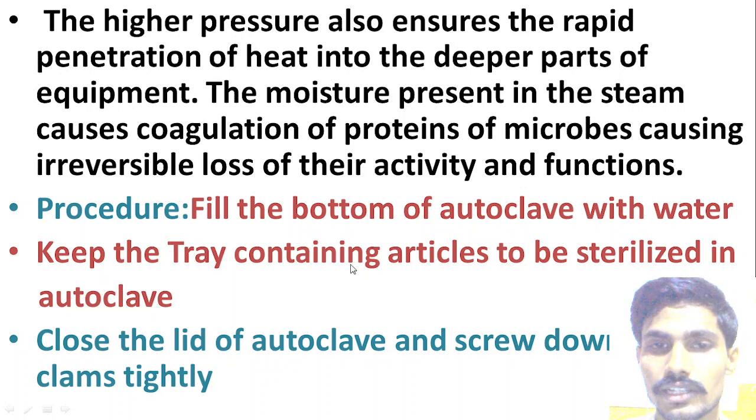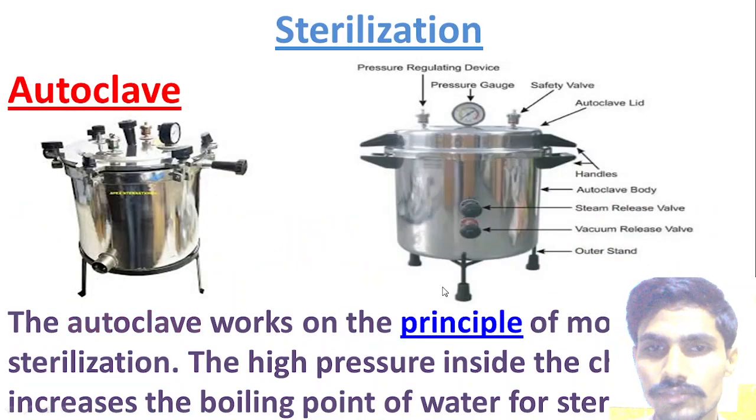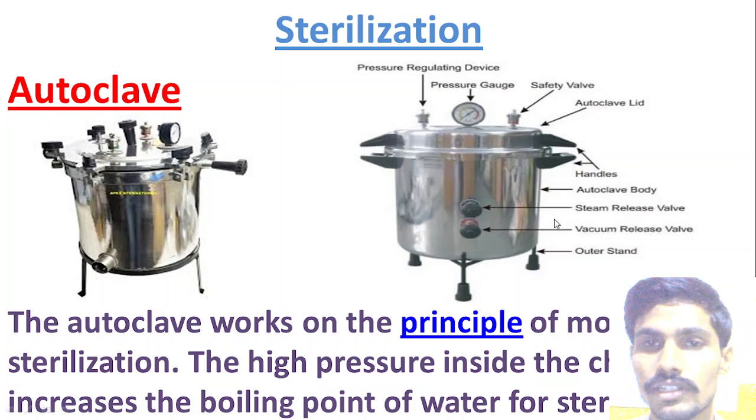Keep the tray containing the articles to be sterilized in the autoclave. After filling the water here, what can you do? There is a tray containing articles to be sterilized.